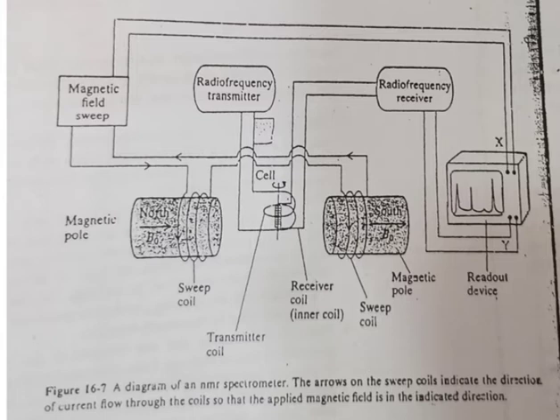This arrow shows the direction of current flow through the coil, so that the applied magnetic field is in the indicated direction.